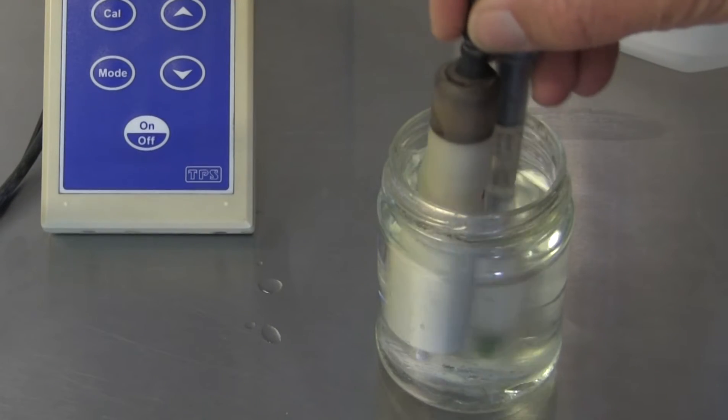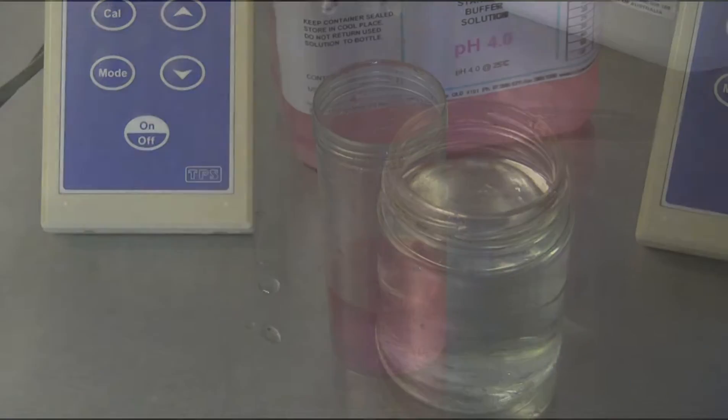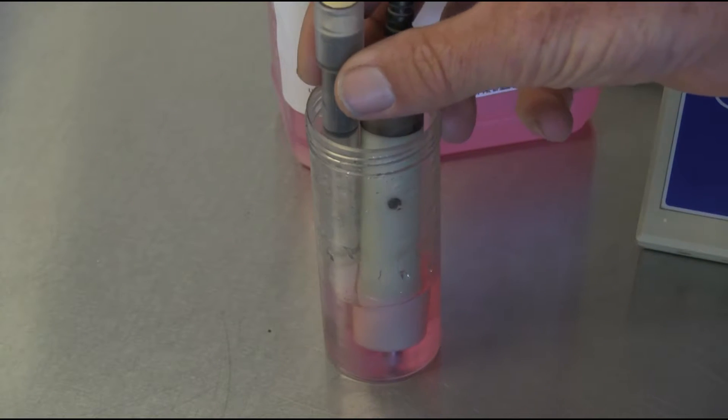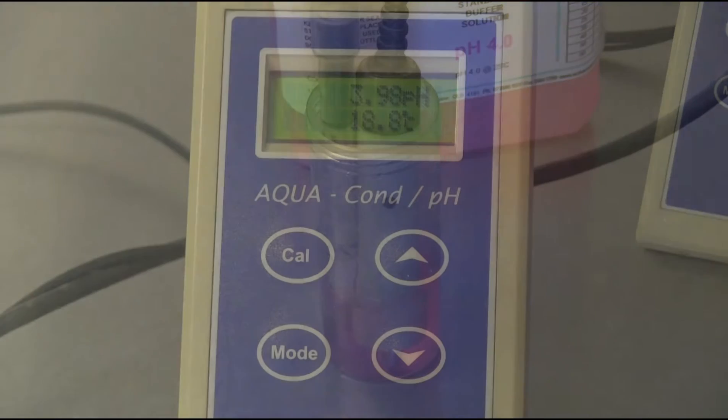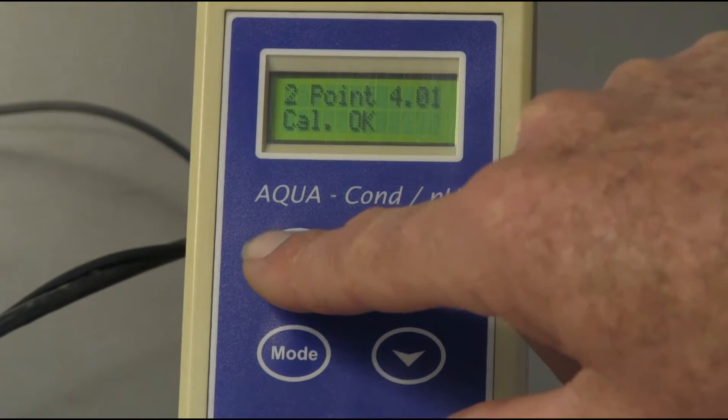Rinse the sensor in distilled water. Remove and very gently shake off any excess water. Immerse the pH sensor in a small sample of pH 4 buffer. Allow the pH reading to stabilize, then calibrate using the same method as the first calibration.